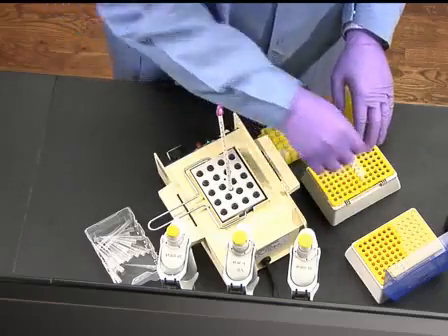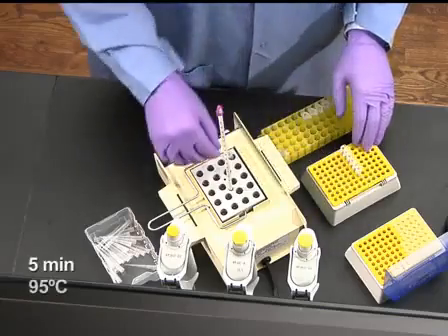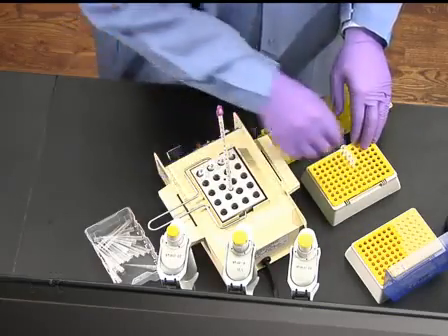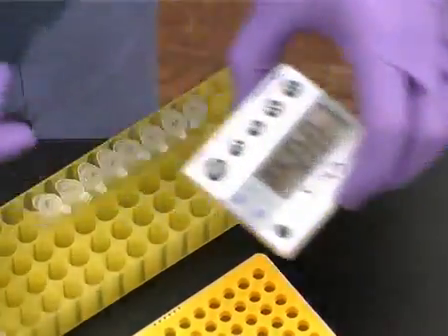Then heat the vials for 5 minutes at 95 degrees Celsius to denature the sample. Allow the heated samples to cool to room temperature.